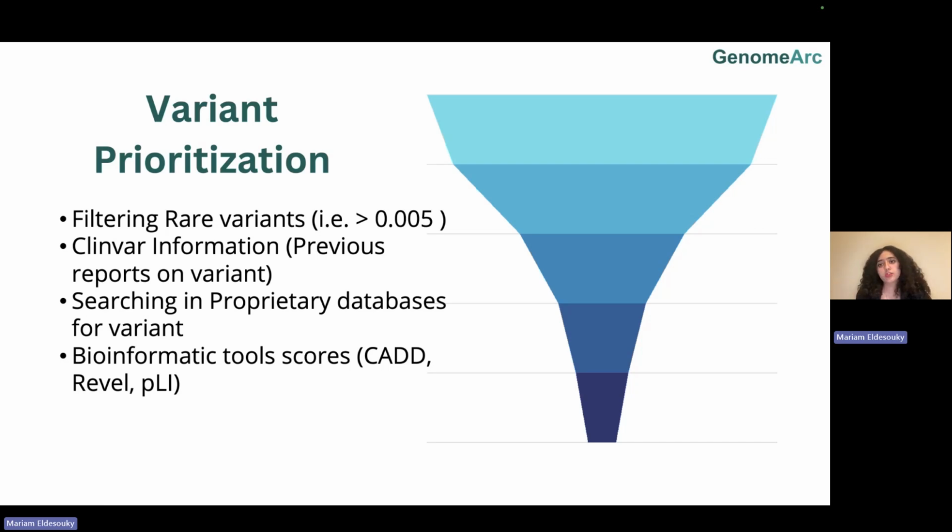Finally, you need to also predict the deleteriousness of the variant, which we do using bioinformatic tools like CADD, REVEL, pLI. So these are all integrated into Horizon, all of this information.